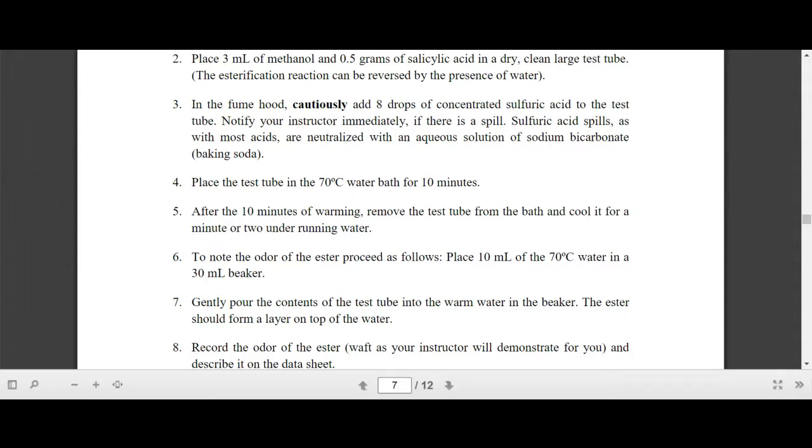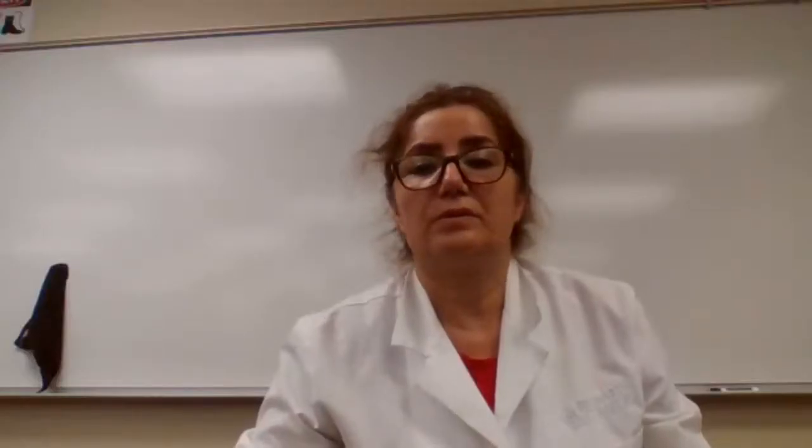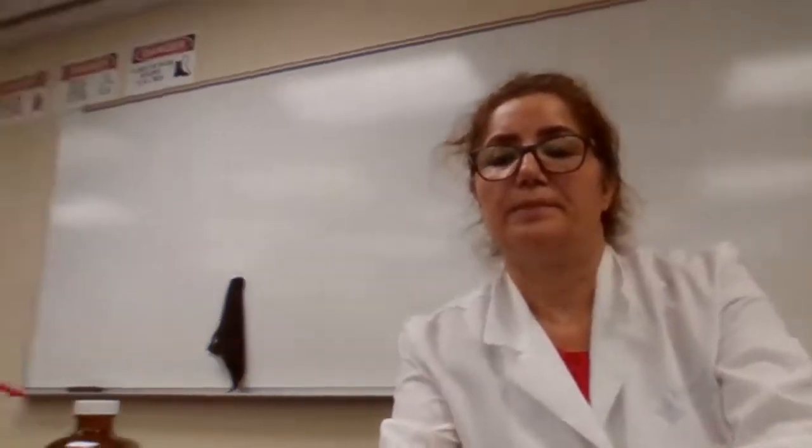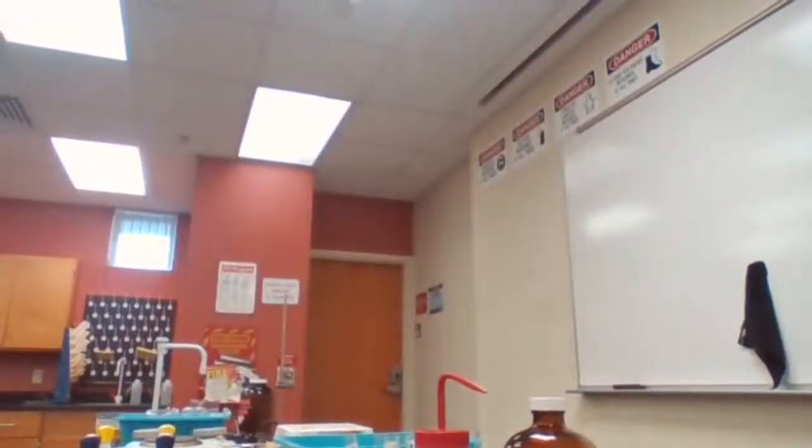Okay. We are doing experiment 6 today, right? Okay, perfect. I'm going to start with the esterification. Now, I'm going to stop sharing this document with you and go to the video now. Okay, we're going to start the first part of the experiment first.